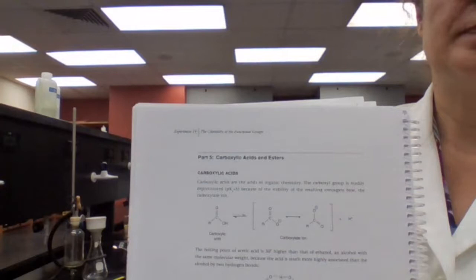Solubility test. Based on solubility test, how would you know you have carboxylic acid?